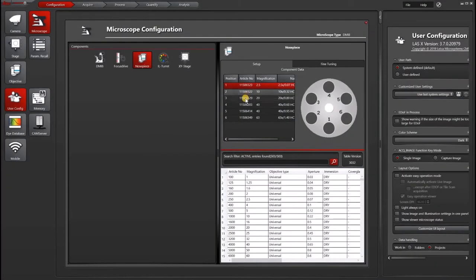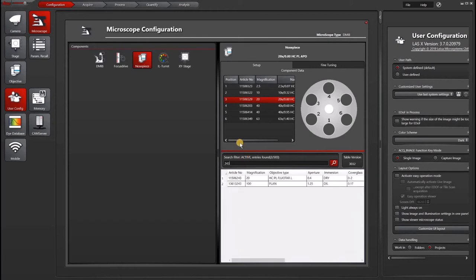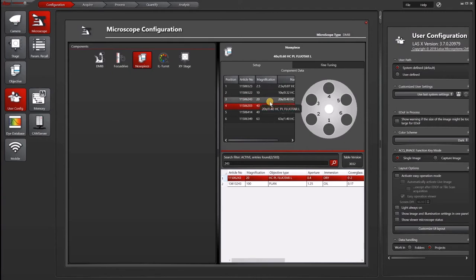So let's say we replaced this 20X objective with another 20X objective, which has the number 506243. Usually the last three digits are enough to pull up that objective, and then I just double click and now it has replaced that objective on the turret.